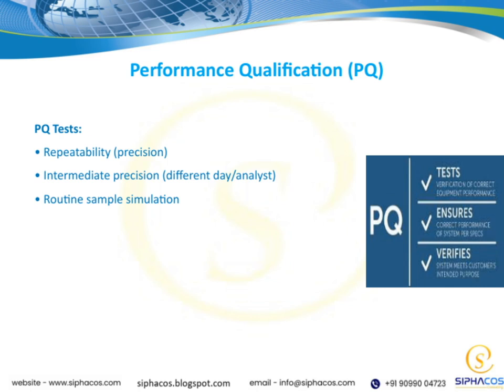So, in essence, PQ ensures that our analytical methods are not only validated initially, but continue to perform reliably over time, supporting the overall integrity of our quality system.